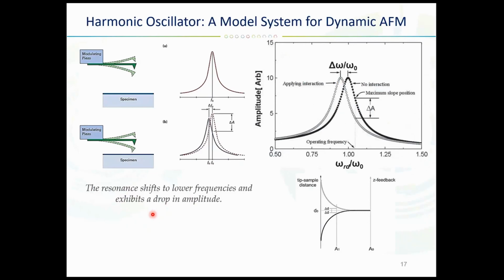And the third parameter is the set point. The set point is basically the reduced target amplitude, and it results after the tip is in intermittent contact with the sample. So it expresses a percentage of the free vibration amplitude. Lower amplitude set points will be better for aggressive tip-sample interaction and more repulsive tip-sample interaction.